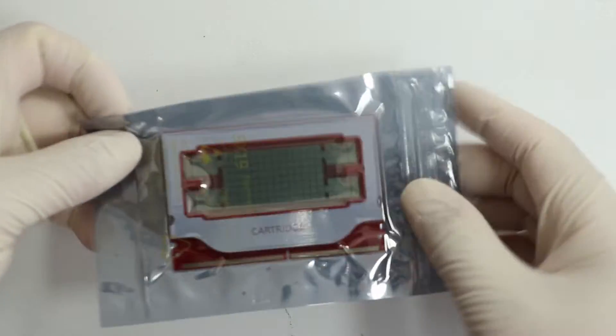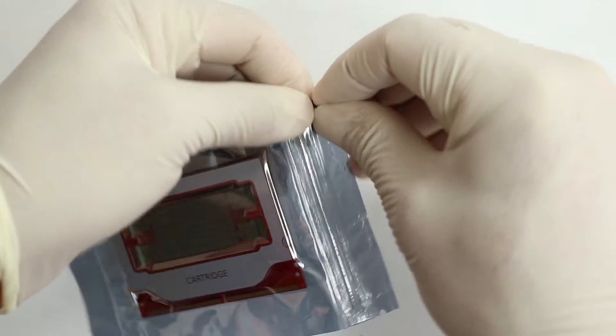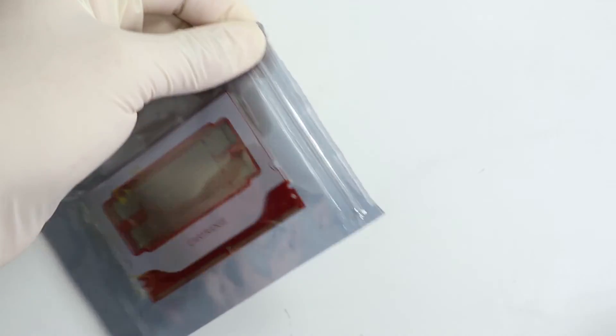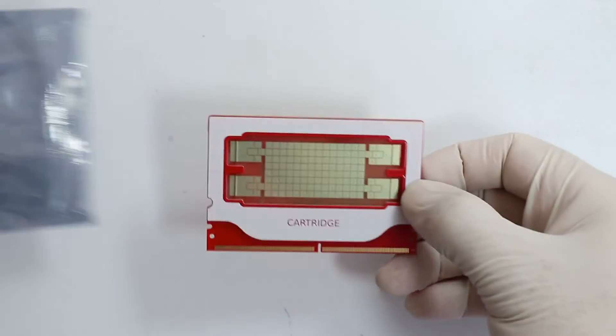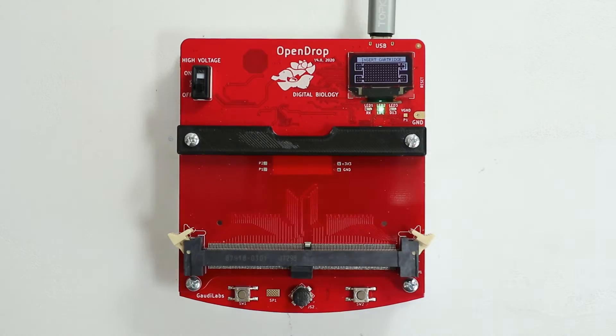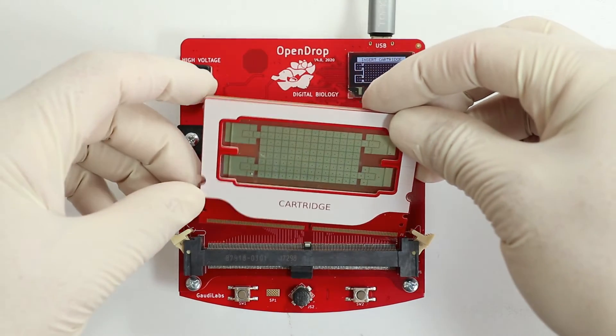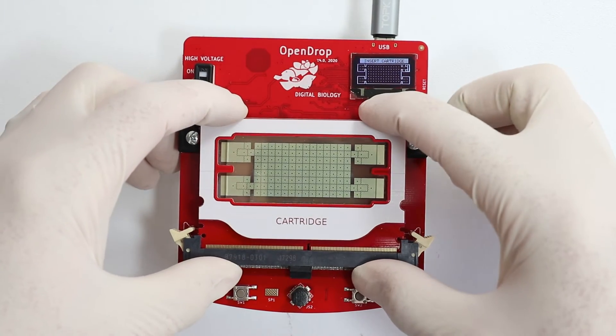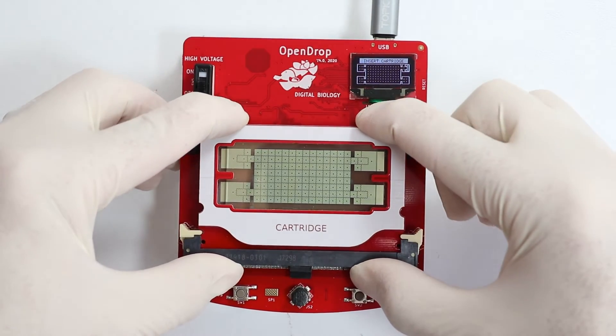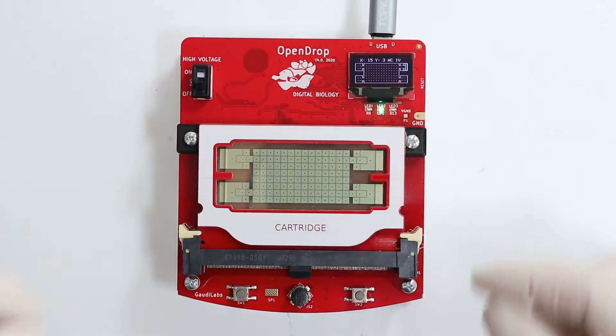The cartridge comes in a specially sealed bag. Open the seal and remove the cartridge from its package. Now align the cartridge carefully in the center of the connector and press in with both hands until the cartridge snaps in.